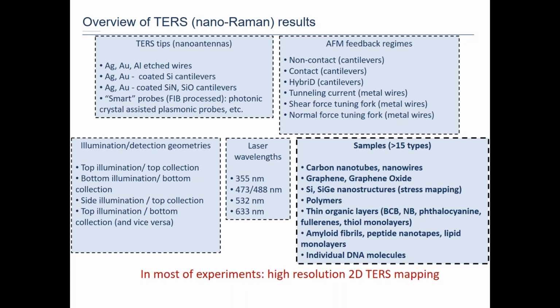But for some types of samples, this regime did not give appropriate results, and this was one of the motivations why we moved to apertureless scanning near-field optical microscopy, and we'll be focused on this topic today.